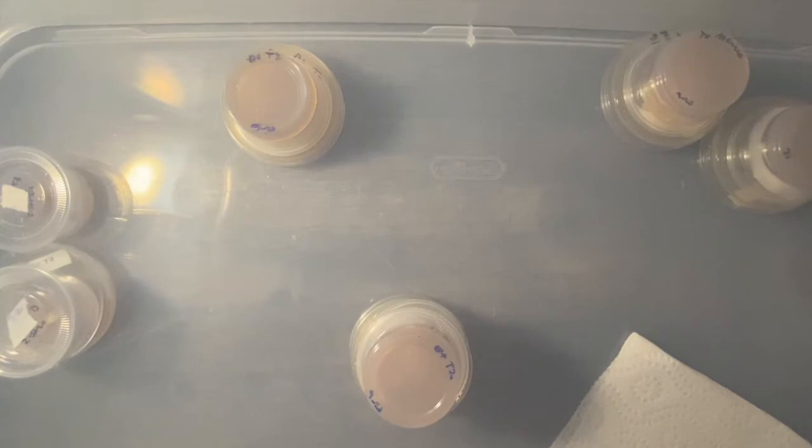Alright, so I forgot to record the first two transfers, but that's okay, it was nothing special. So, I'm not the best at transfers at all. I'm still trying to get my technique down, but I thought I might as well take you guys on my weekly agar to agar. So I do this every week or every 2 weeks.